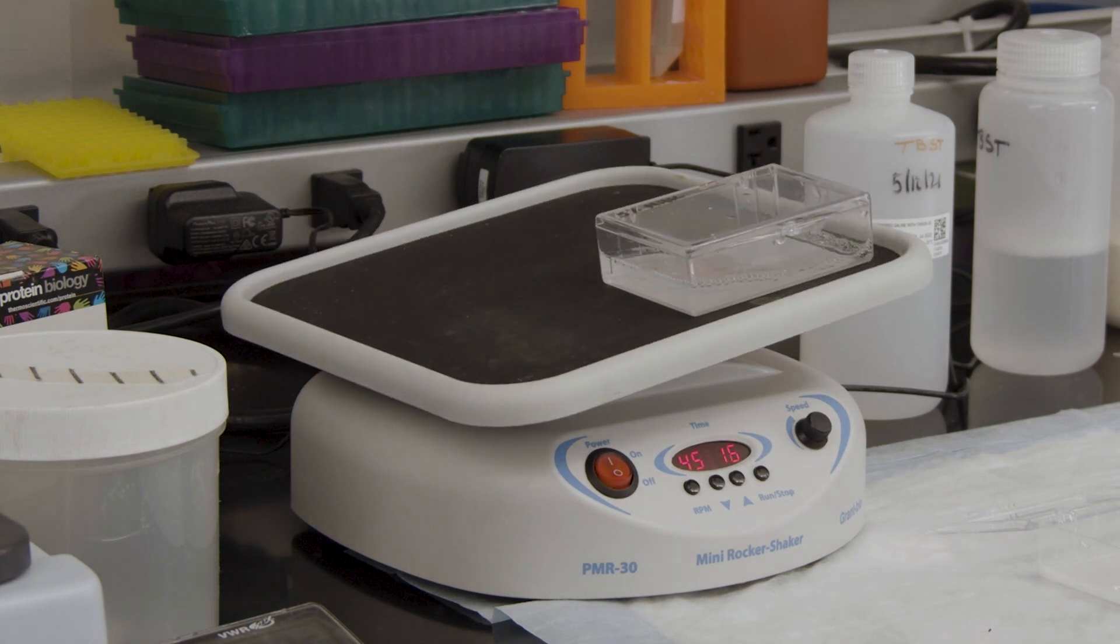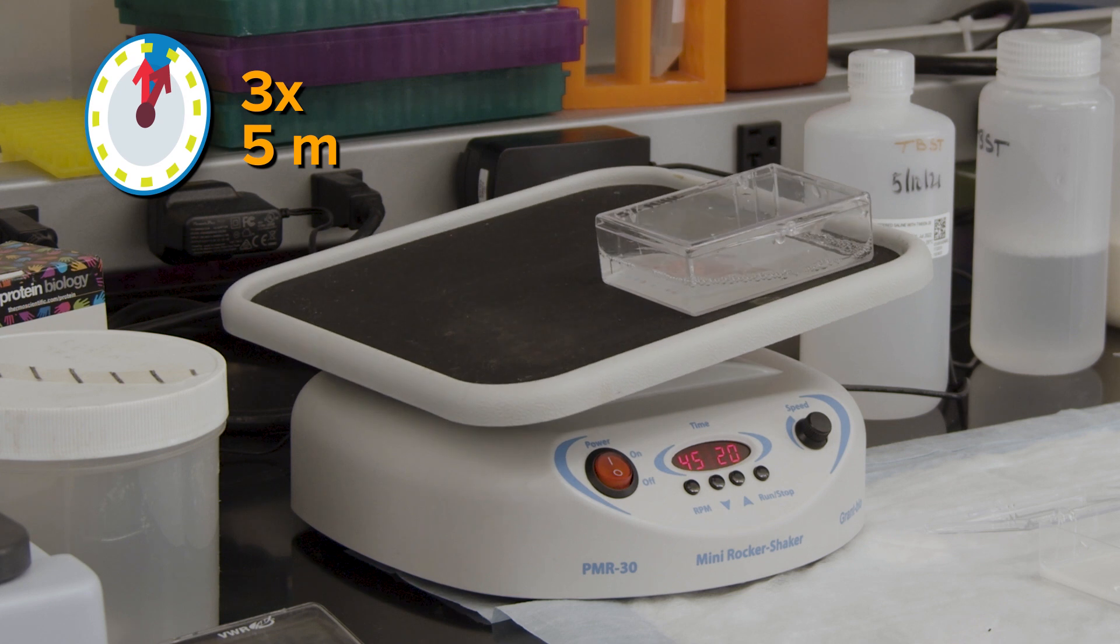After the primary antibody incubation is complete, wash the membrane three times for five minutes in the wash buffer, just like before. If your primary antibody is directly conjugated to a detection label, no secondary antibody is needed. You can go ahead and proceed with the chemiluminescence detection step.